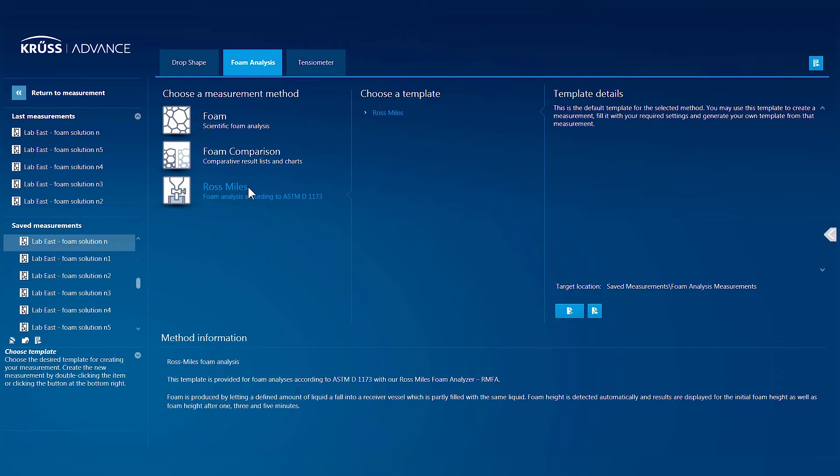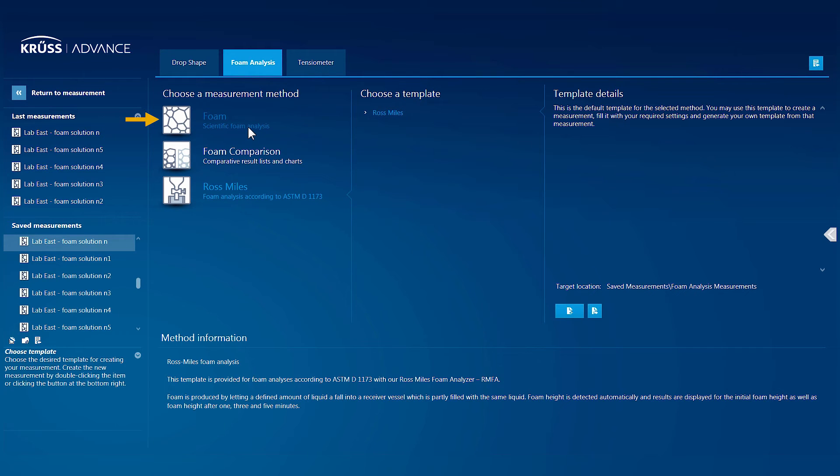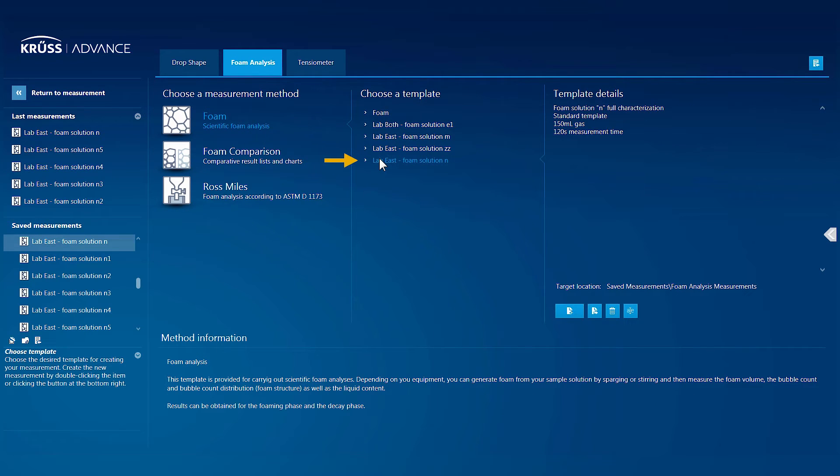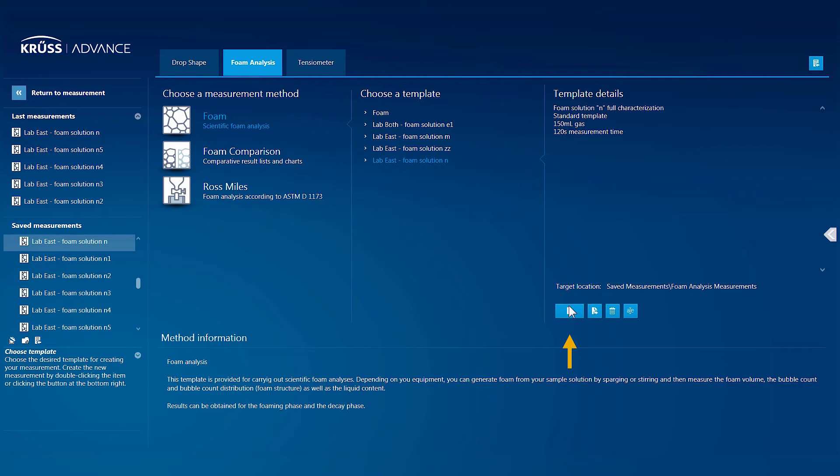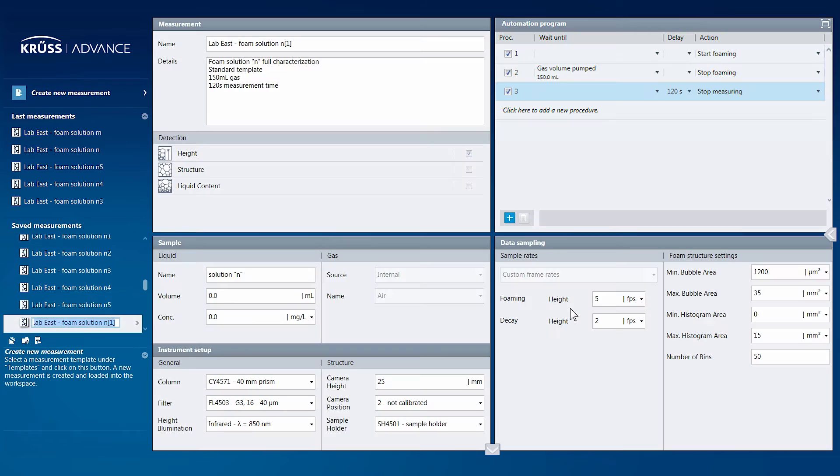Let's get started. Simply select a measurement method and the template which you wish to use. Now, click the Create New Measurement button to jump right into the workspace which is already prepared and ready to run the measurement and analyze the data.